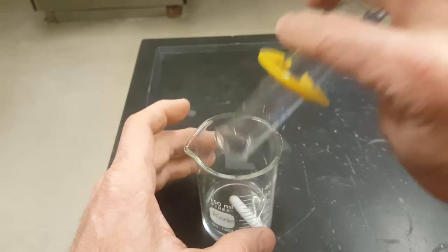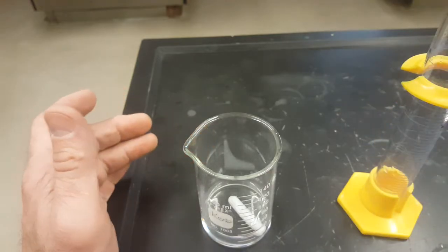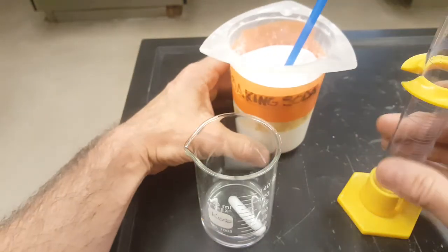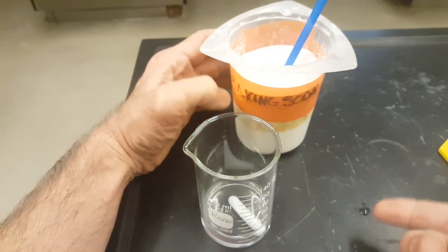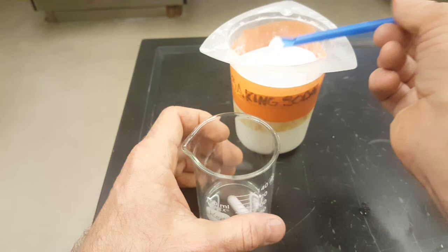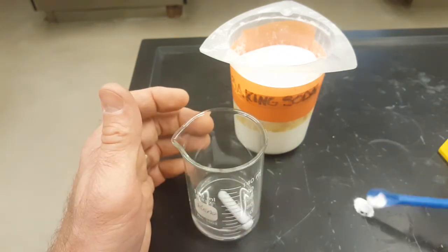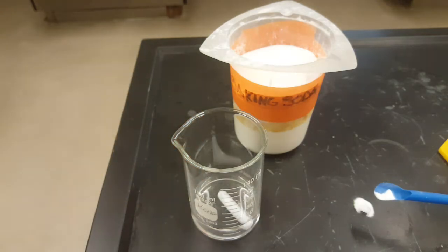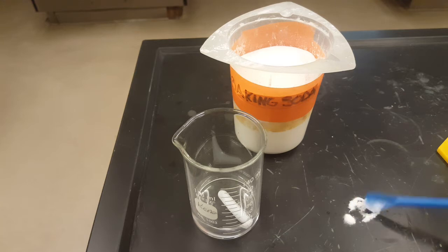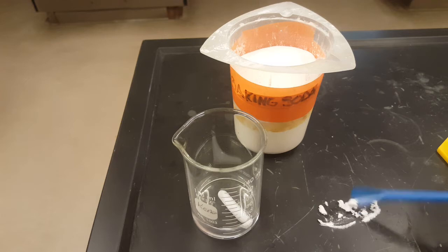And as a safety tip, if you have any spilled acid, I have baking soda placed throughout the lab. And if you have any drops of anything on your lab bench and you think it looks like water and you're not sure, don't touch it. Just put some baking soda on it. If it fizzes and bubbles like that, then you know that it's an acid. Keep adding the baking soda until it stops fizzing and bubbling, and then wipe it up with some paper towel and put that in the garbage.